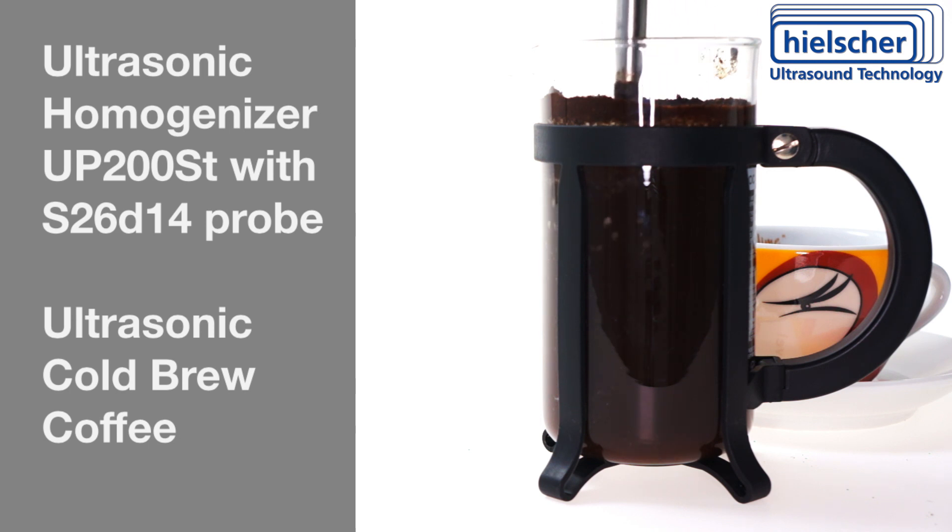Then use a Hielscher UP200ST ultrasonic homogenizer with a 14mm probe at 100% amplitude setting to non-thermally extract the coffee quickly. This typically takes about 30 to 50 seconds depending on the size of the French press.